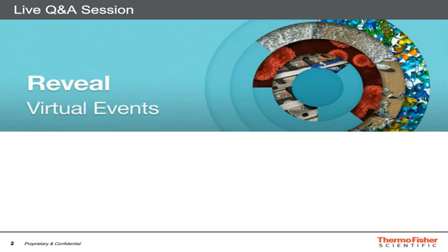Great. Moving on to the next question. I think it's also for you, Paul. What is the difference between GDOES and XPS techniques regarding the chemical analysis of the surface?